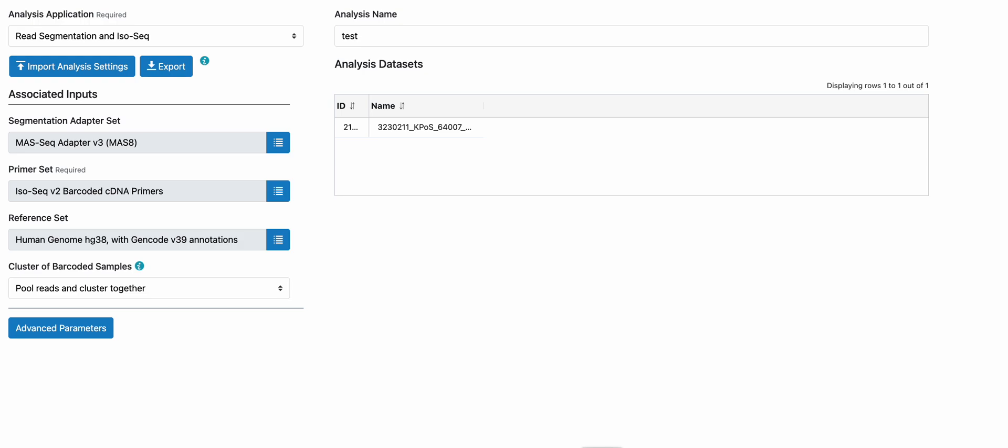The Kinnex full-length RNA kit is an 8-fold concatenation kit. To properly deconcatenate the hi-fi reads, the segmentation adapter set would be the MAS-Seq adapter v3, MAS8 is shown here.